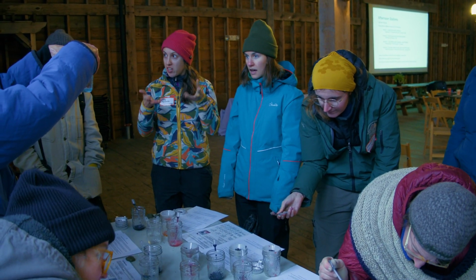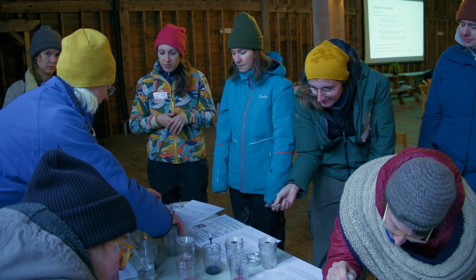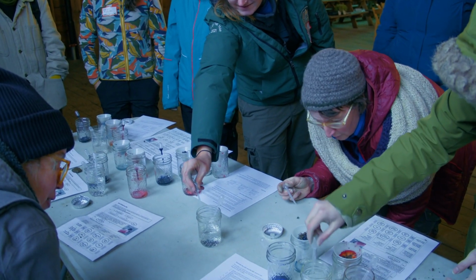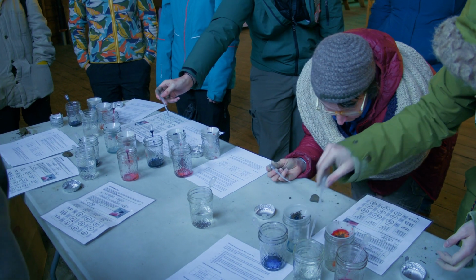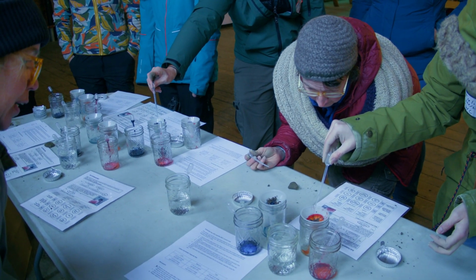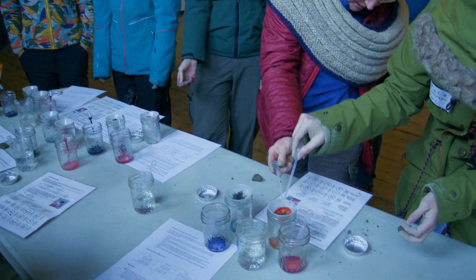You're not getting some water coming out of there. You can give it a little more water. Don't be too shy with that, so you can start seeing that. It's pretty light. You guys are pretty light, right? You had probably more clay here, or probably more organic? Clay, yeah, just a little bit. And definitely. That's pretty light too.